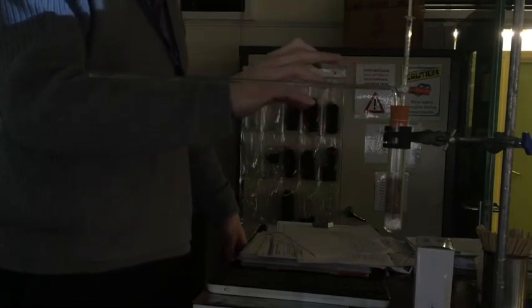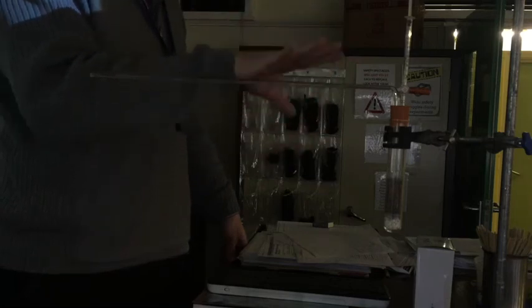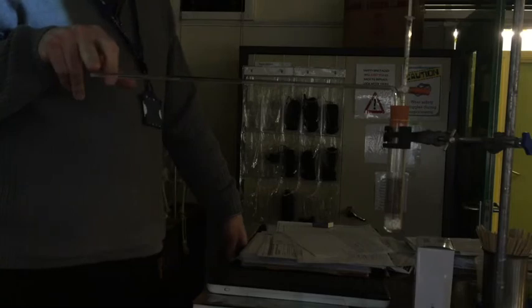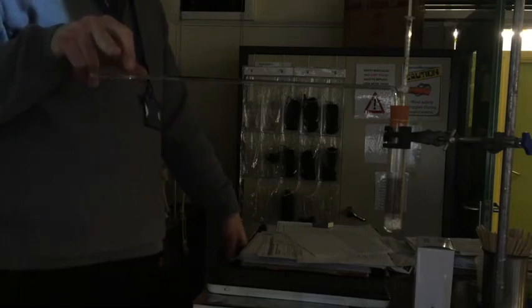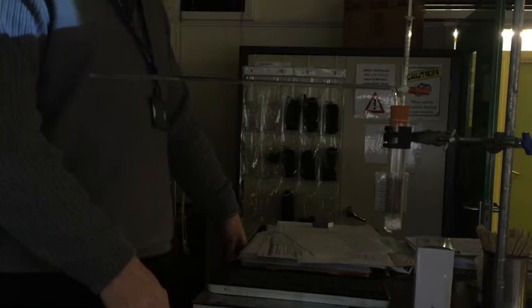So now we're ready to go. We've got this three-way tap. At the moment the tap is open to the outside. When we turn the tap around, it's not going to be open to the outside anymore. At that point it's going to be a closed system, and carbon dioxide is going to be produced and oxygen is going to be used. Now in that situation, this wouldn't move, because the same volume of oxygen used would equal to the same volume of carbon dioxide produced. So if it produced a milliliter of carbon dioxide, it would use a milliliter of oxygen. So that would be pretty pointless for an apparatus, wouldn't it? It's not going to measure anything.